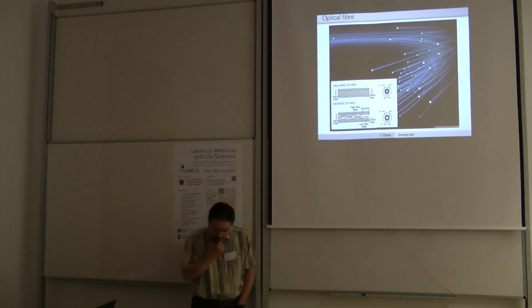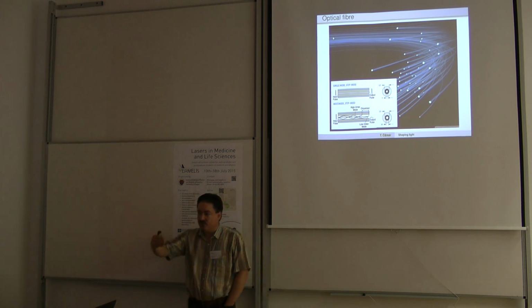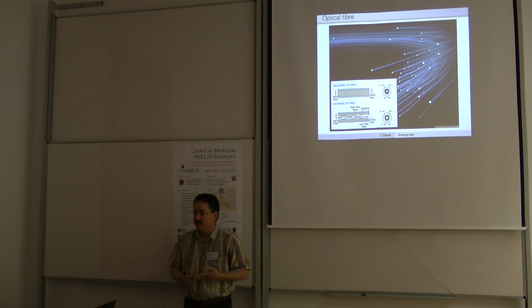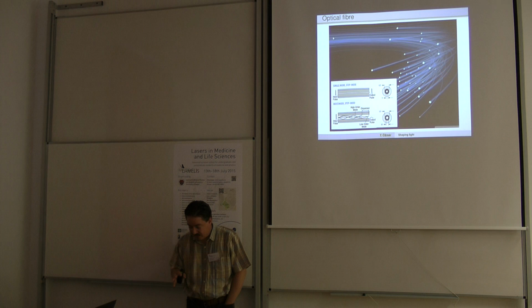Right. So that was the first attempt to correct for horribly scattering materials. You can go as deep as you want, it doesn't make any difference, right? Because once the beam is totally scattered and you don't have any ballistic photons, you are in this highly diffusive regime. You can always correct it the same way, and you can always enhance the signal by the same number as the number of segments that you use, right?